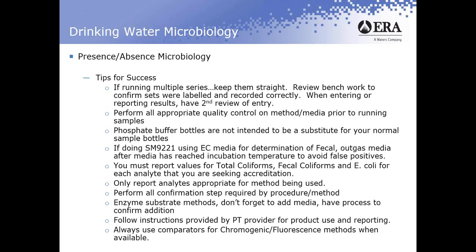If doing standard methods 9221 and using EC media for the determination of fecal, you want to outgas the media after the media has reached the incubation temperature to avoid any kind of false positives.